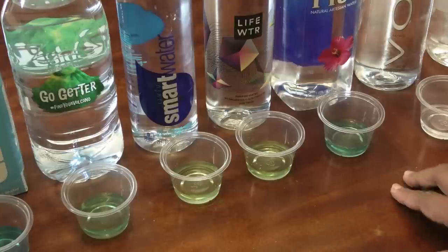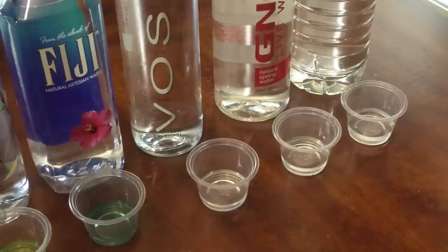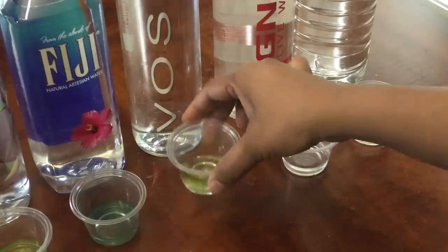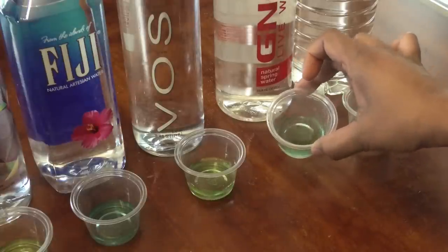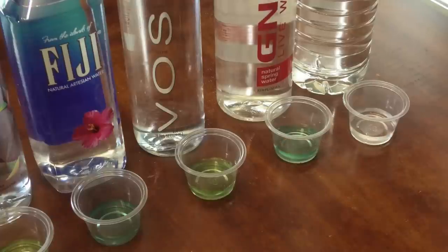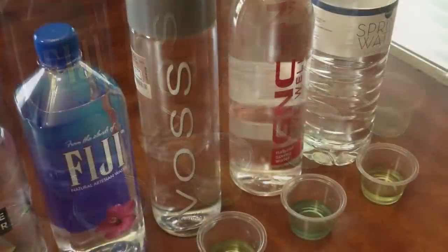Next is Fiji — the Fiji water has a light blue color, but it's not as blue as the Just Water and Zephyr Hills. Comparing it to the Florida tap water, the Florida tap water is much more alkaline than the Fiji water. Next is Voss, which is a very expensive water, and as you can see it is acidic. Next is the GNC brand, which has a blue tinge — more of a neutral. And the Publix spring water is acidic.